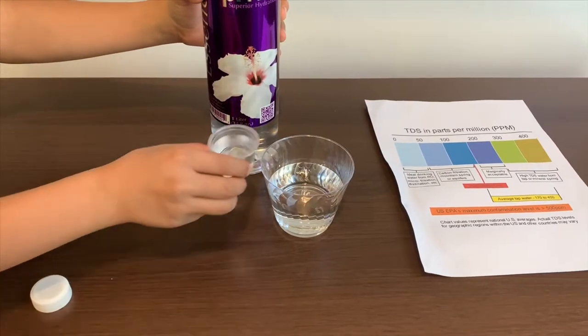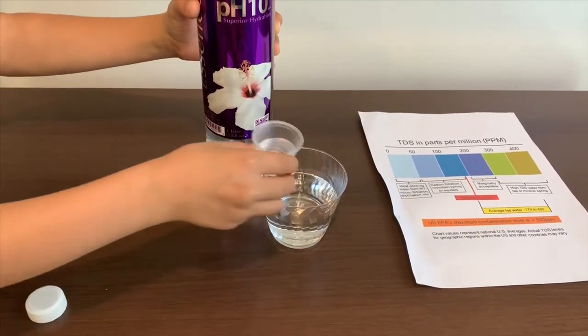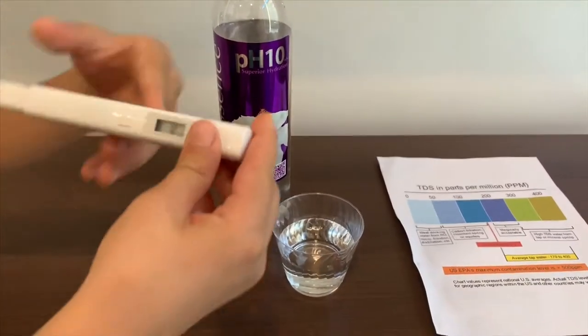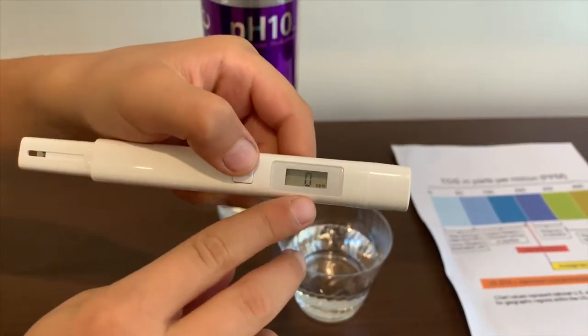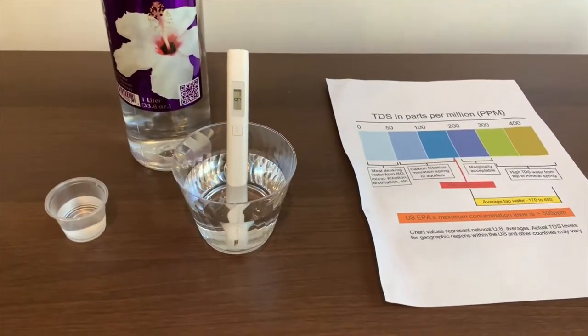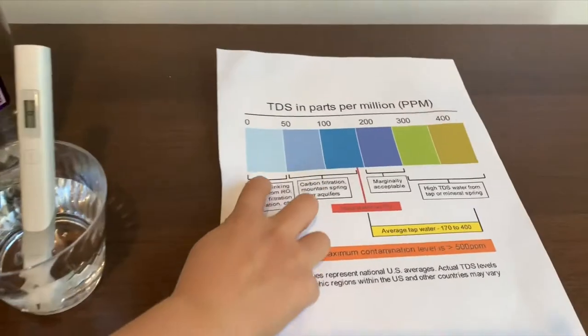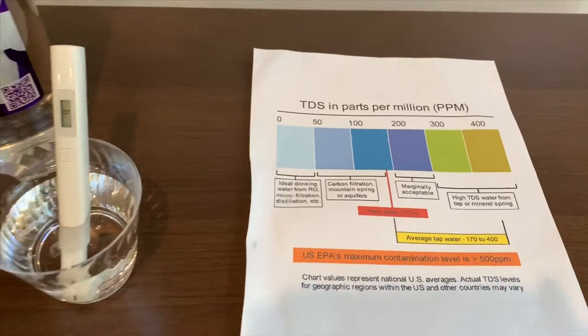Let's test the TDS first. Turn on the TDS tester, make sure it says zero, and put it in. It is at 9 — that is ideal drinking water. Now let's test the pH level.